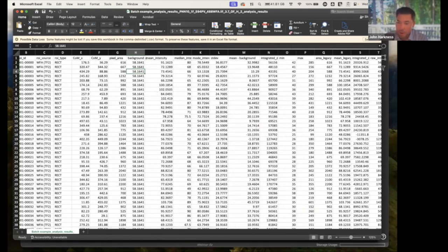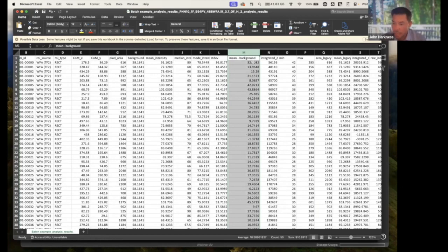And so what I have here is both a mean background for my image and then the intensity. And what I like to do is take the mean minus the background score, which in our lab we interpreted as signal, and report that. And so what I'm seeing here is this is now the quantification of the intensity of that fluorescence. So going back to that question, I think this might be what you're looking for. This is a fantastic way to quantify intensity.